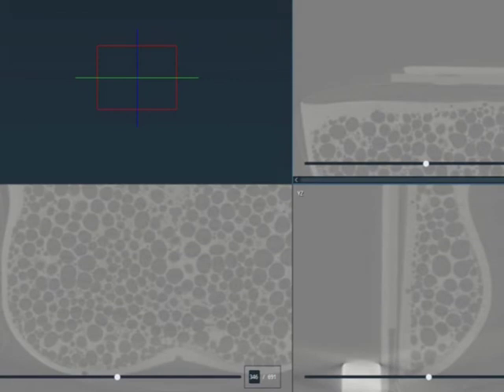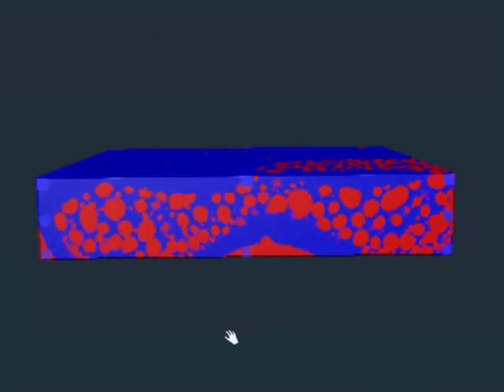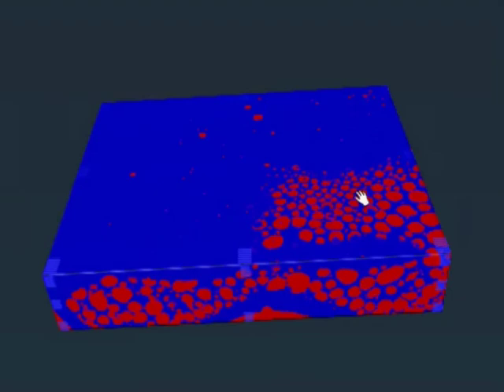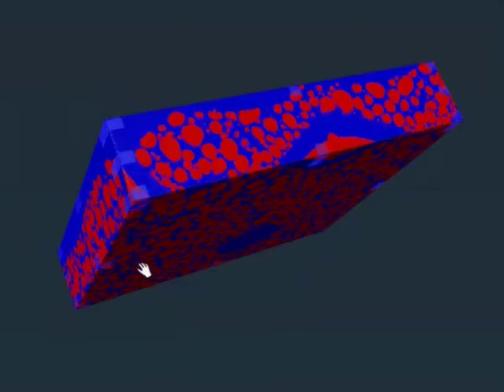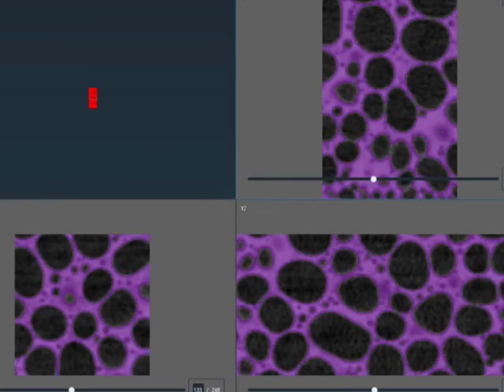So I actually took the Aero bar, and you'll see here that I segmented the chocolate and the air inside the bubbles. The goal of this was to assign them their own volumes, and then calculate the percentage of volume occupied by a bubble and occupied by chocolate. I took a bunch of different slices to get a good number, and this is the one that I was most happy with.